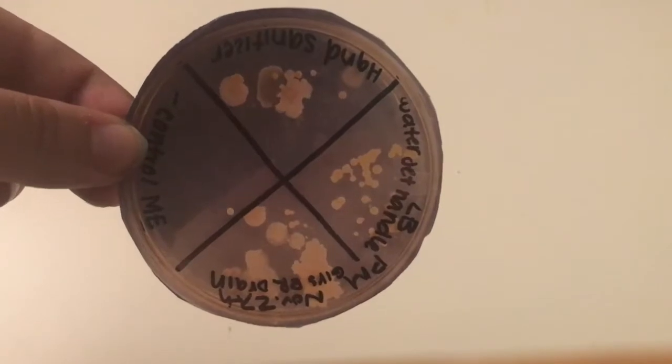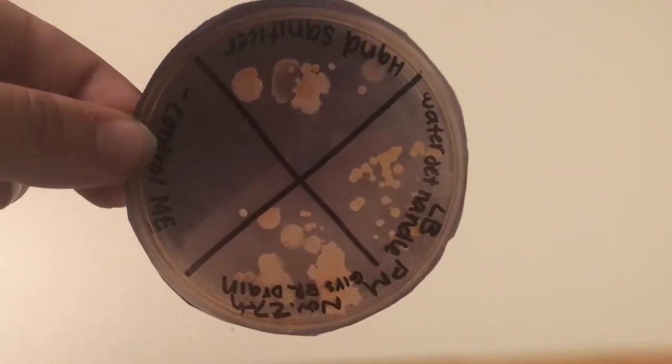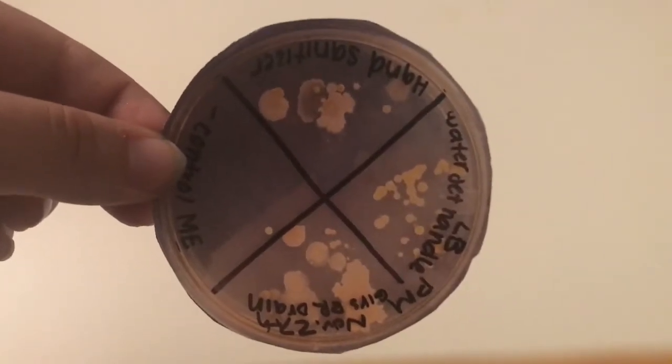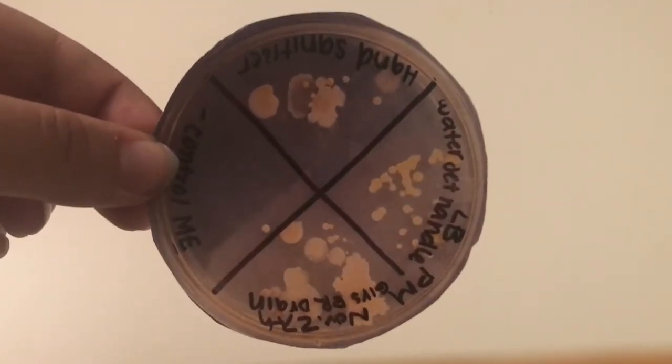Recently, my class did a lab where we went to different parts of our school and swabbed for bacteria. This is a picture of my plate of LB agar after I swabbed 3 different areas of the school. After gram staining my bacteria on a slide, these are my results. They're small, pill-shaped bacteria, and they're purple, which means that they're gram-positive rods.